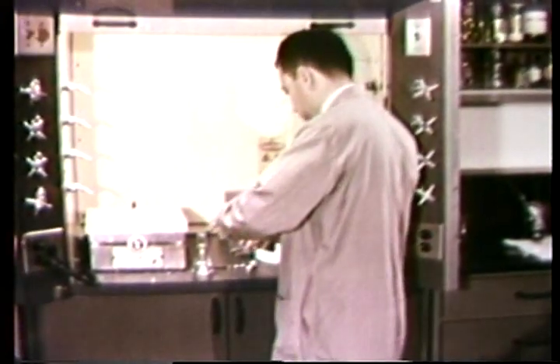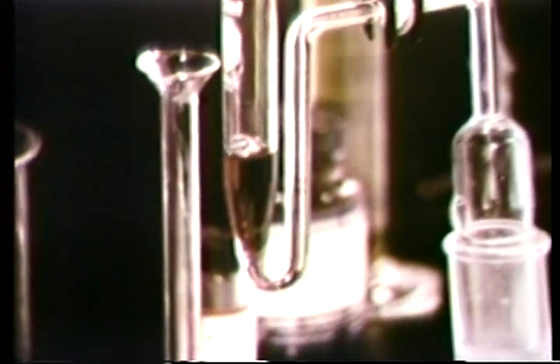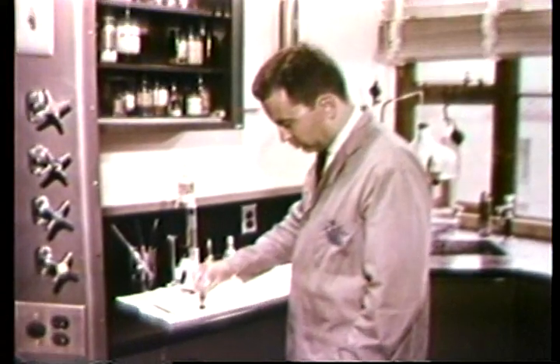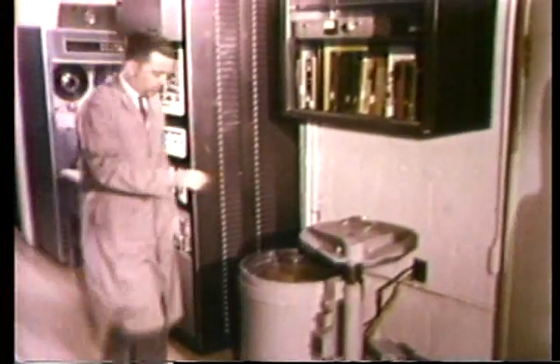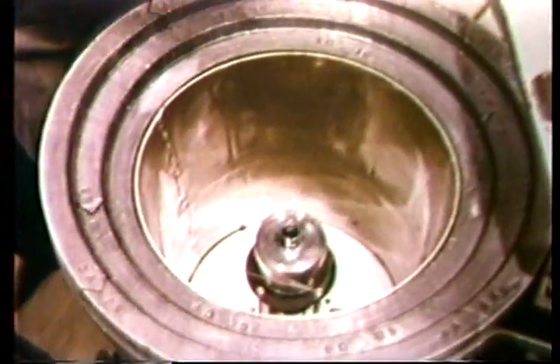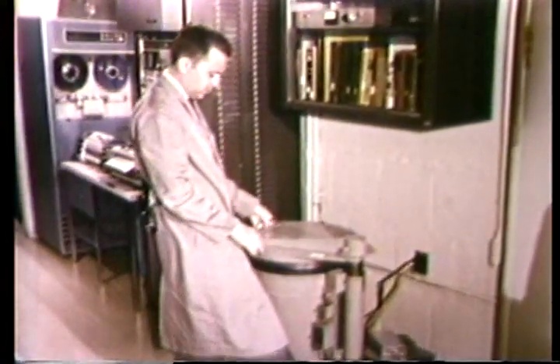When the bone was exposed to the neutrons, atoms of many of the elements present were made radioactive. After chemical processing, any radioactive arsenic will be isolated in this liquid. This is now poured into a glass container to be analyzed, and the container is then placed in a lead-shielded radiation detector. Radiations characteristic of arsenic are sensed by the detector and can be read by the analyzer.